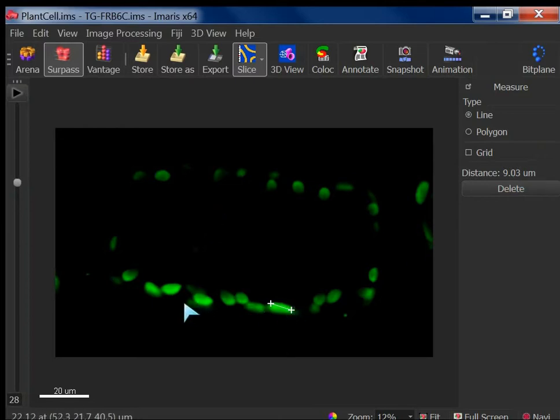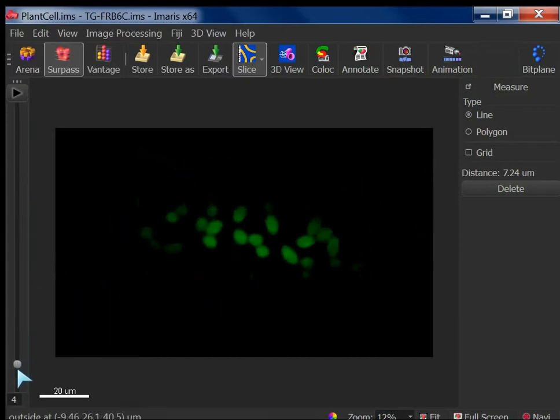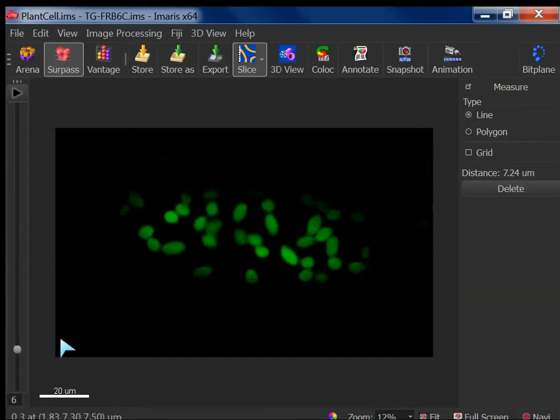Okay. Yeah, but just to give you, I'm not... Don't go into the biology. Yeah, you have to just focus on the largest object size. Right? So, yes, and also I'm not a biologist, so I don't understand.